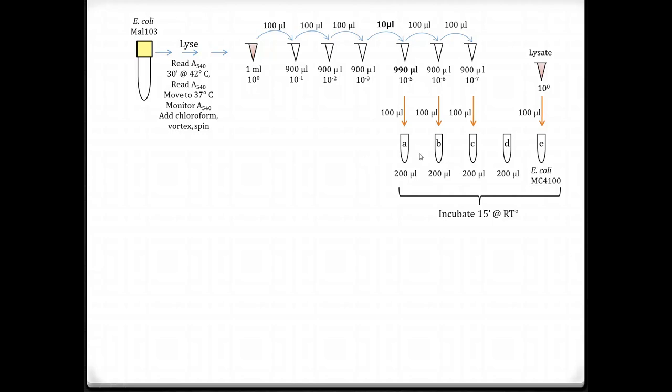These are the disposable glass tubes that we use for experiments, where we keep the caps but throw the tubes away when we're done. At the end of 15 minutes, you're going to get the pre-measured top agar from the hot water bath, one at a time. Don't grab several of them or else they will solidify in your hand and in the tube. You pour top agar into the tube and onto the plate.